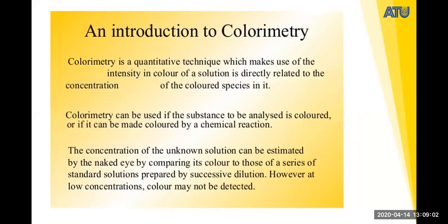An introduction to colorimetry. Colorimetry is a quantitative technique which makes use of the intensity of color of the solution related to the concentration of the colored species in it. Colorimetry can be used if the substance to be analyzed is colored, or if it can be made colored by a chemical reaction.